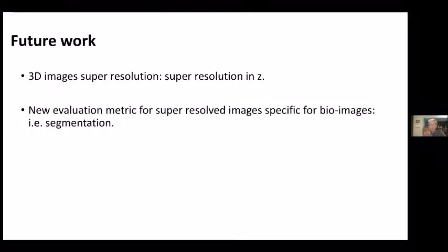I only had one other comment, and that was with k-means or other methods of segmentation of multidimensional data. Is there any application for statistical methods like principal component analysis? Is that something that is used in this field? Yes, we often use PCA for this kind of analysis. Actually, that's the first thing we tried before we tried k-means. To my memory, it didn't perform as well as we wanted, so we changed direction to k-means. Surprisingly, it performed very well. But yes, PCA is very commonly used in the field.